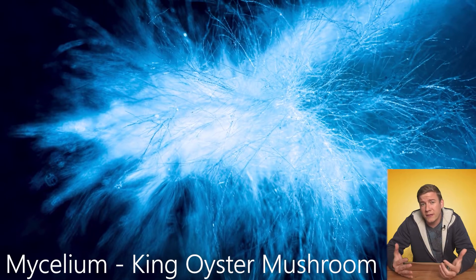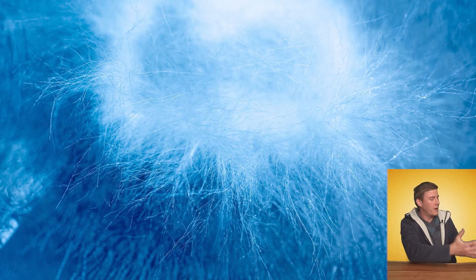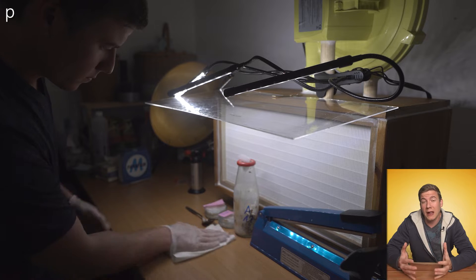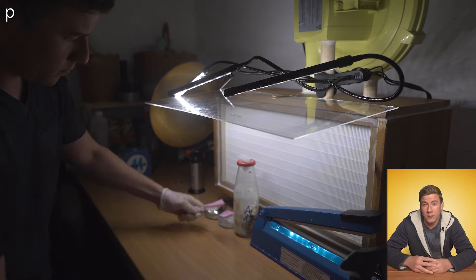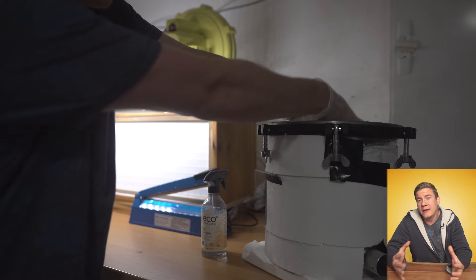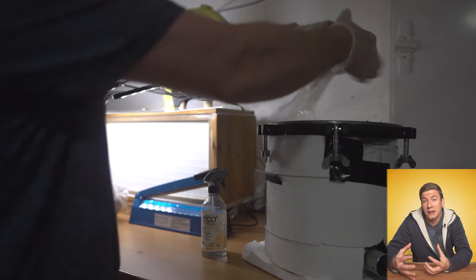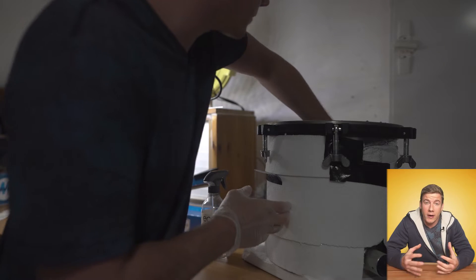You could also use liquid mycelium, but that's not the topic of today's video. We're going to focus on how to actually make these grain spawn bags, and the most important thing is to keep everything as clean and sterile as possible. I spray a lot of isopropanol, which really helps to avoid contamination, and I also use a very simple laminar flow hood. I sterilize the bags at 15 psi for about two hours, then leave them inside the autoclave — there's still heat inside which can kill remaining contamination. After one day, when the bags are cold, we're ready to go.